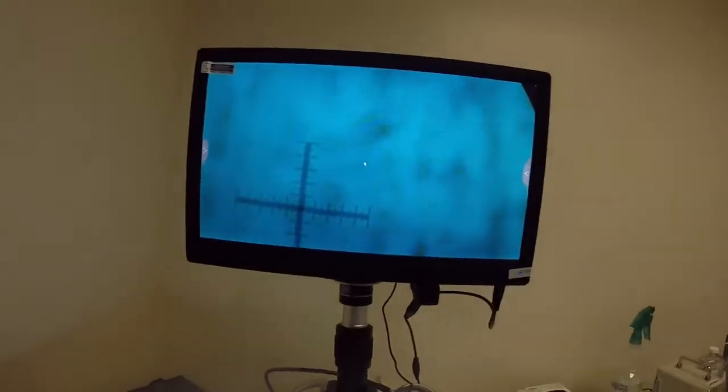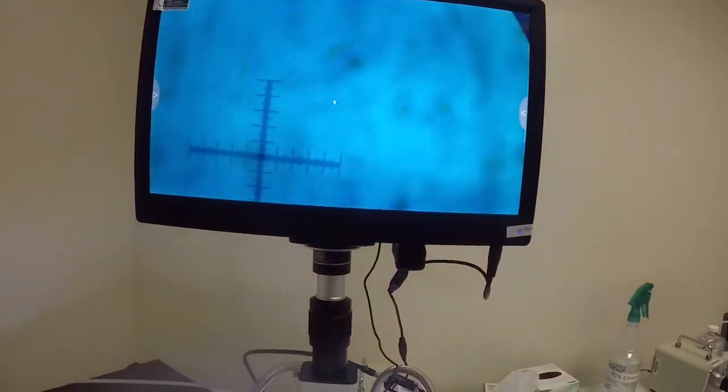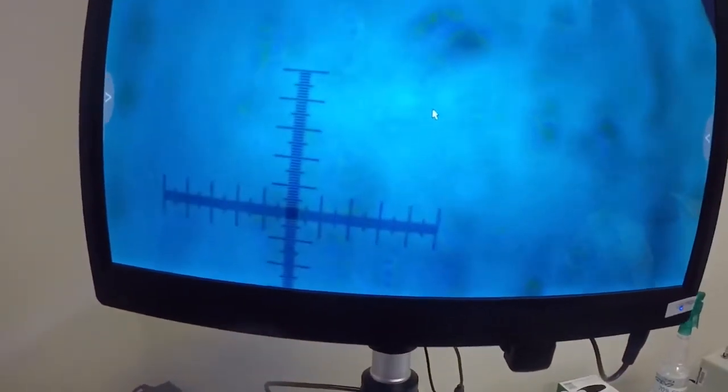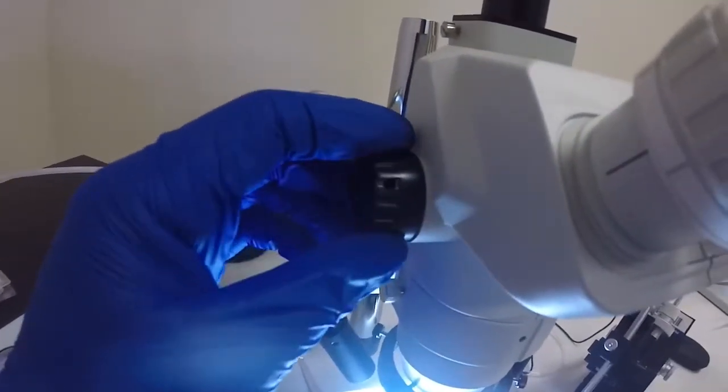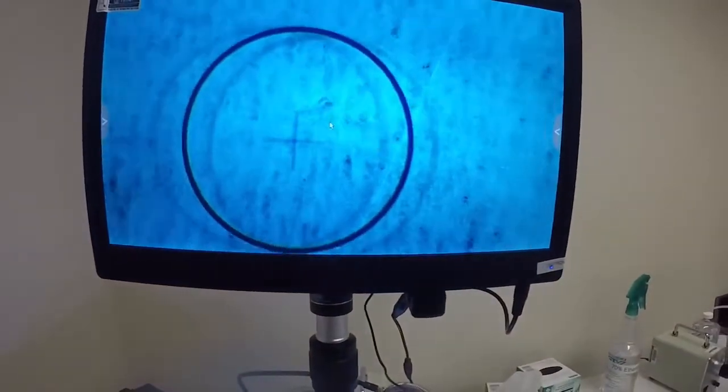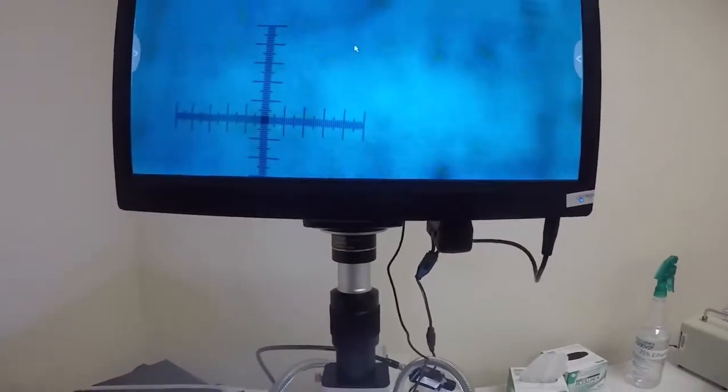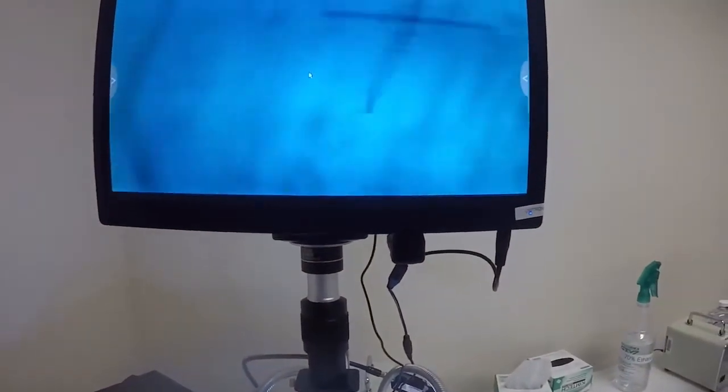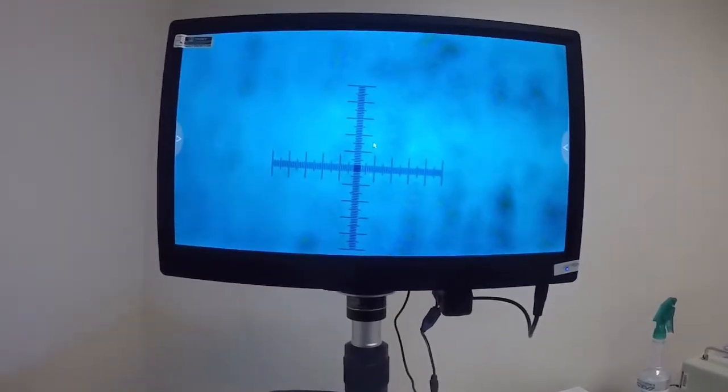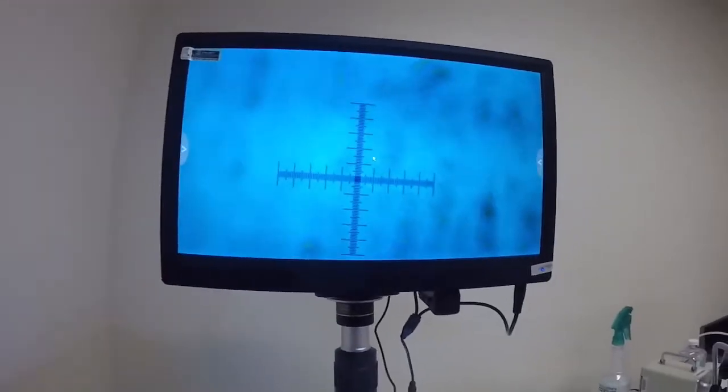So you can see it on the monitor here. It's a little out of focus. So this knob right here, this fat knob is your focus. So as you can see, when I twist it, some things come into focus and out of focus. You want the micrometer in focus. And then this is your zoom, these smaller knobs towards the front. You can pull it way out or zoom way in. I like to have it closer, and then just adjust your micrometer appropriately and you're almost ready to start calibrations.